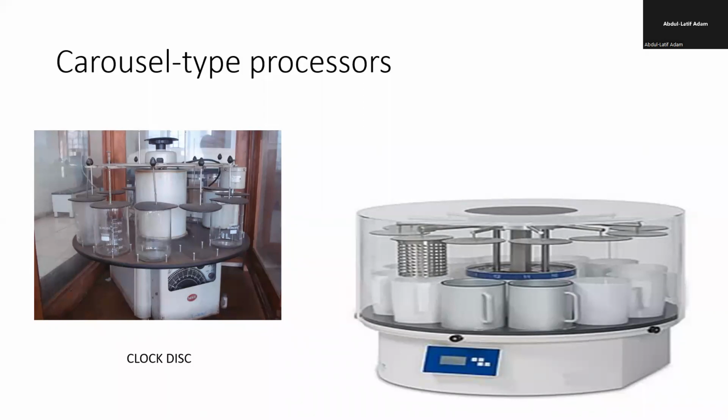You set the time and then it will do it by itself, unless there is a power flash. If there is no power fluctuation, it's the same. That is the advantage of the digital over the disk.